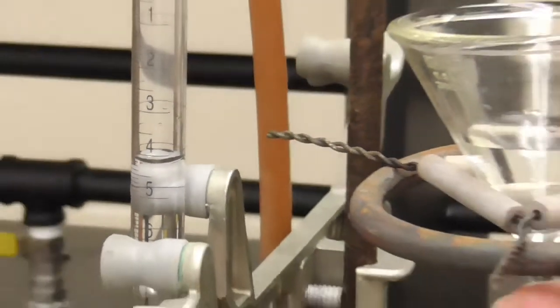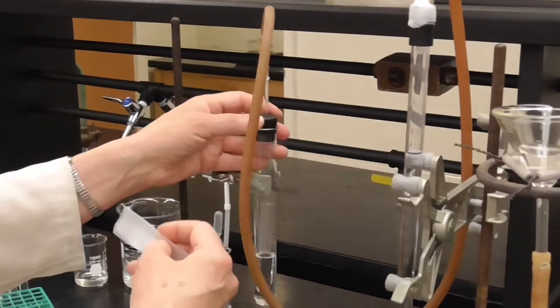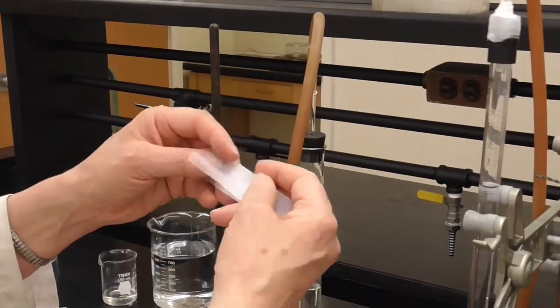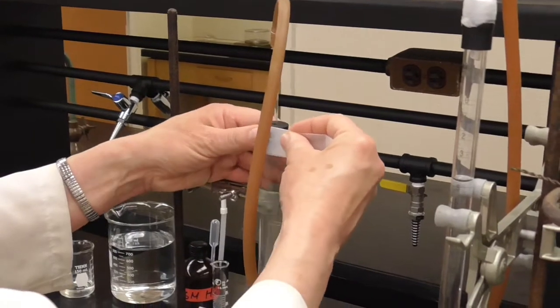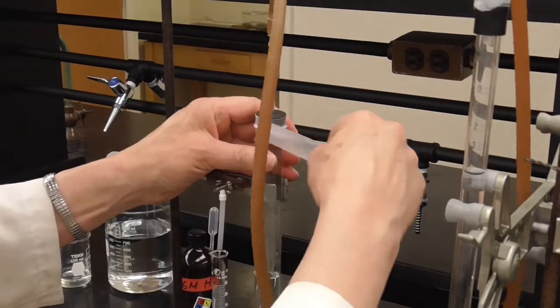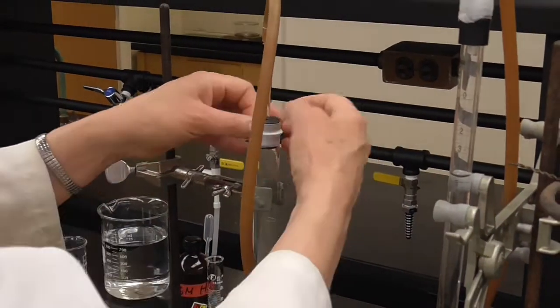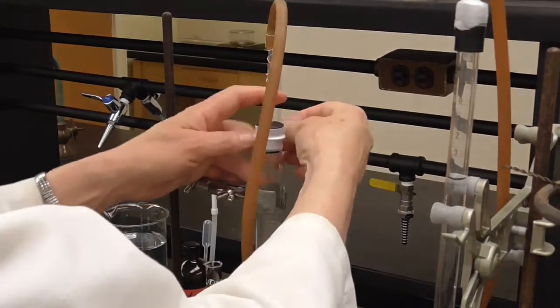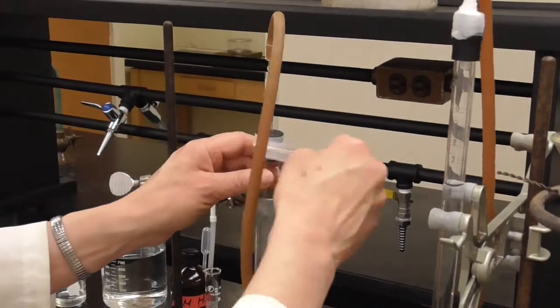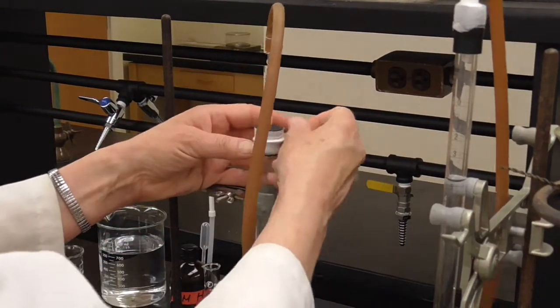And at this point, we want to check the apparatus for leaks. So what I'm going to do is make sure that that's on there tight. Another place for leaks to occur is at this connection point. So I've taken a piece of parafilm, and I'm going to just stretch that parafilm around there and make this a hopefully leak-tight connection. At this point, after this is done, we hope we don't have to take that apart again to find any more leaks in the apparatus.